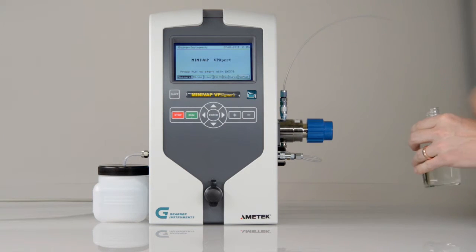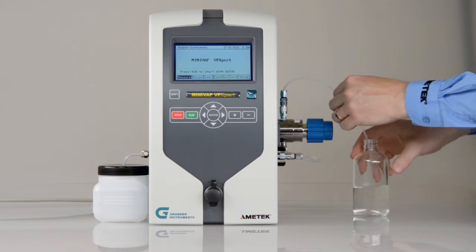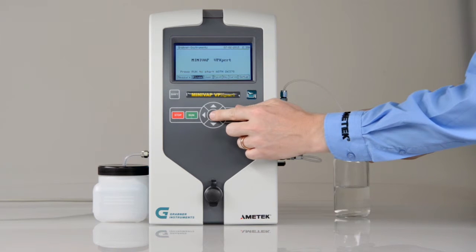Before you turn off the VP Expert at the end of the day, rinse the instrument with a cleaning solution mixed with toluene, acetone and methanol to clean the measuring chamber.